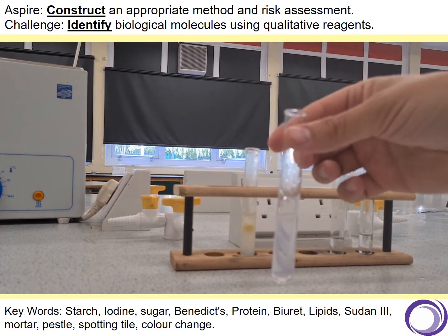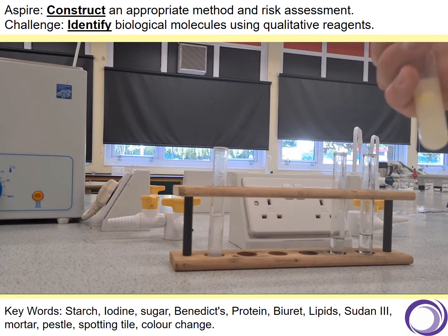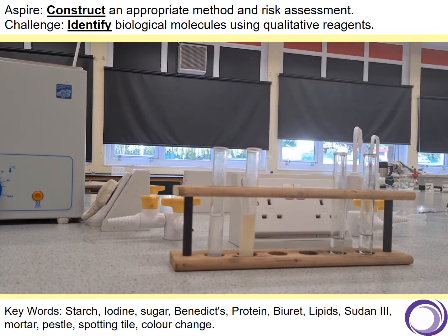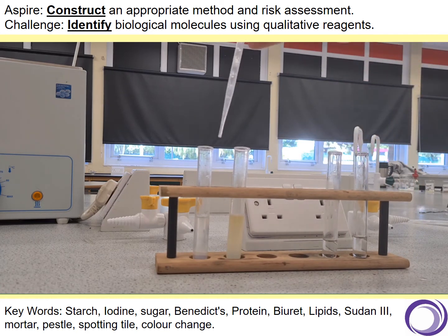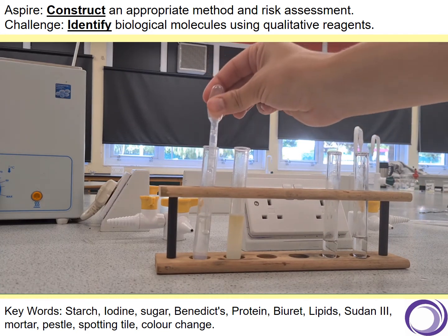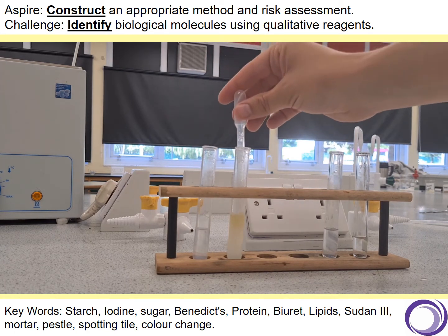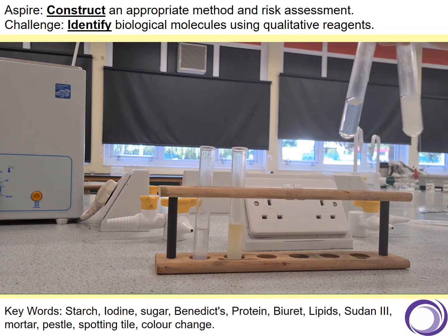You can see that this one is not very cloudy at all. I'm going to give this one a shake. Okay, it's very cloudy. Now to double test that, if you want to improve this a little bit, I've got two test tubes with just some more distilled water in. If you take this out here, and then you add it, and if I take this one out, I add it, it helps you to see the difference a little bit more.